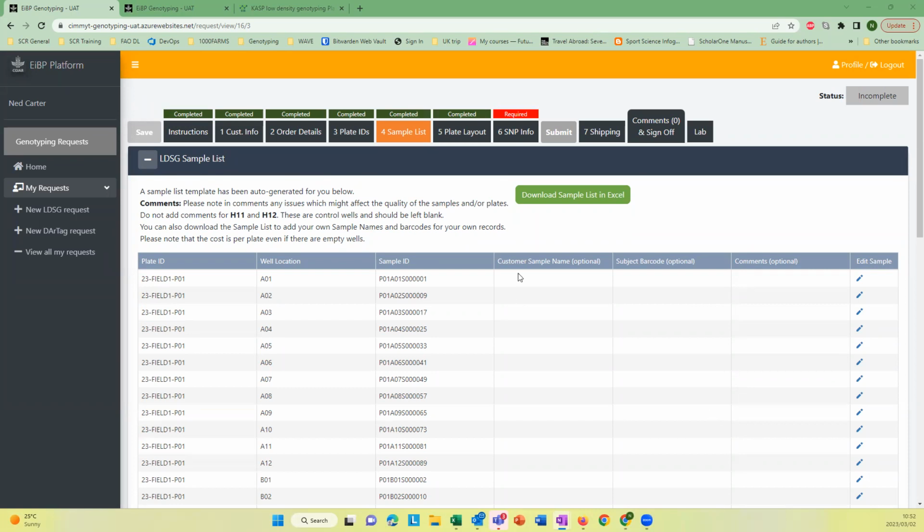We don't want to go through another step of data merging before you do analysis, because these sample IDs are meaningless as they are not connected to the genotype you want to run your analysis on. Having those extra steps creates room for errors. Yeah, understood, Ismail, and this is well noted, so it will be worked on.